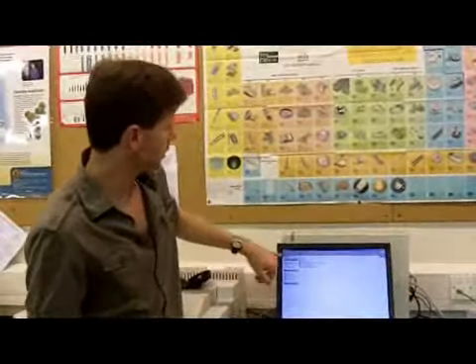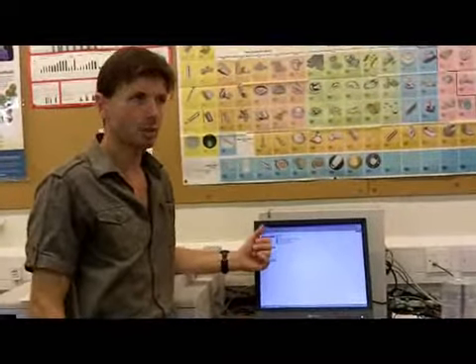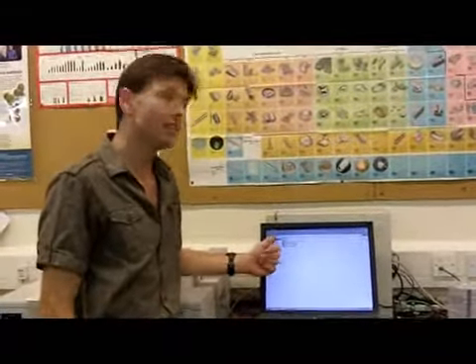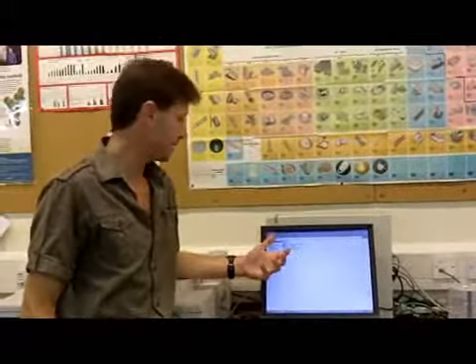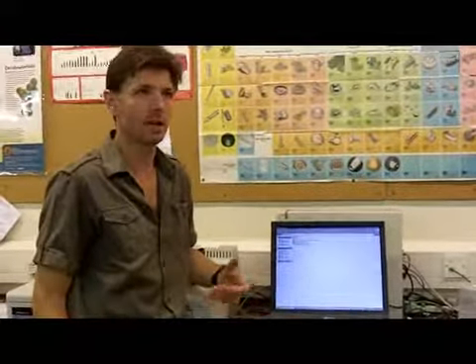If you go onto the disk, into the directory for the STM-XPS experiment, you'll see three directories. One's got the XPS data, one's got the STM data, those are the pictures, and one's called WSXM, and that is the program you will use to analyse the images. And I need to explain to you a little bit about the program so that you can use it properly.